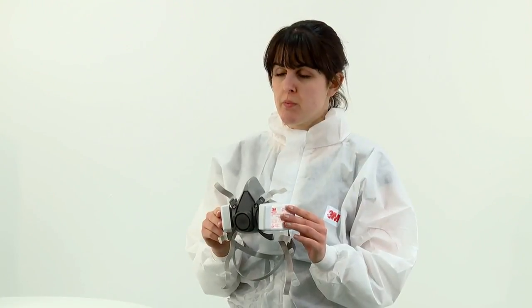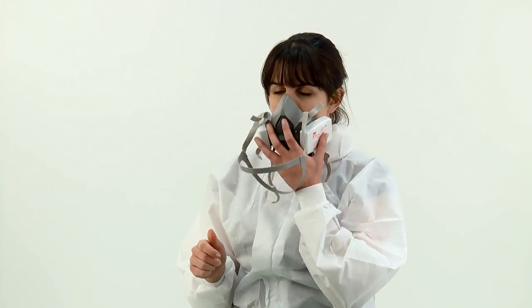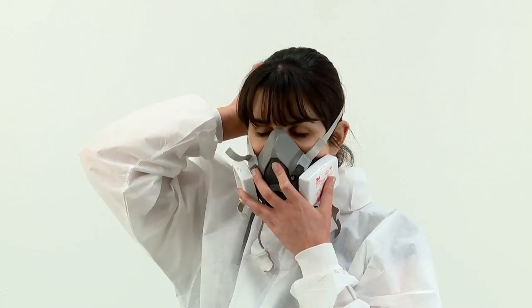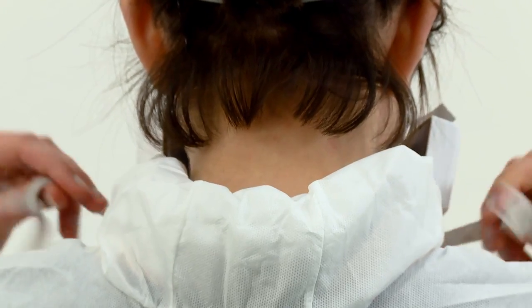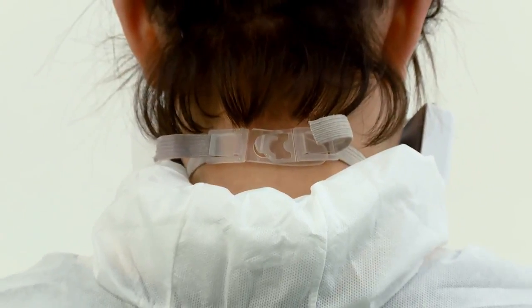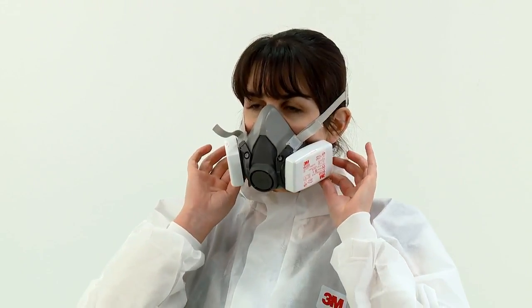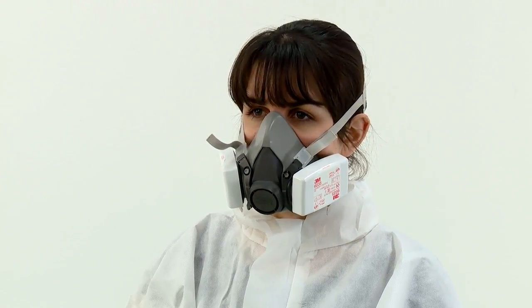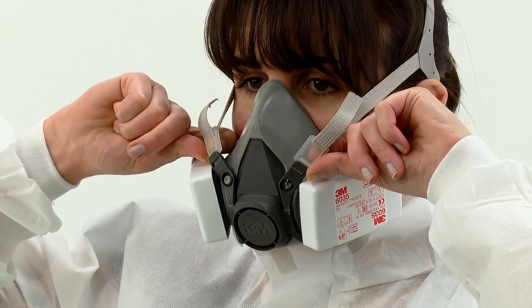The method of fitting the respirator to the face is the same regardless of which filters have been fitted. To fit, place the respirator over your nose and mouth, fitting it comfortably on the bridge of your nose. Then pull the head harness over the crown of your head. Next, take a bottom strap in each hand and hook them together at the back of your neck. Ensure the straps have not become twisted. You can tighten the top head harness by pulling on the end of the straps to achieve a comfortable and secure fit. The bottom straps can be tightened in the same way. It should feel snug against your face but take care not to over tighten. Strap tension can be decreased by pushing out on the back of the buckles.